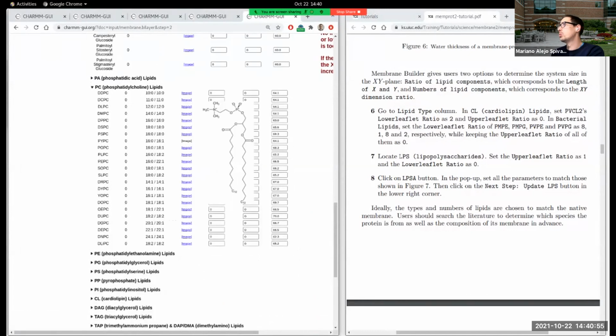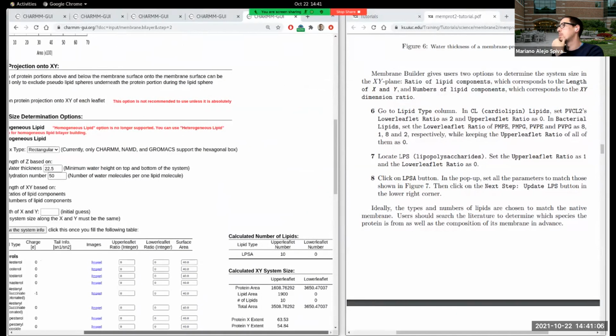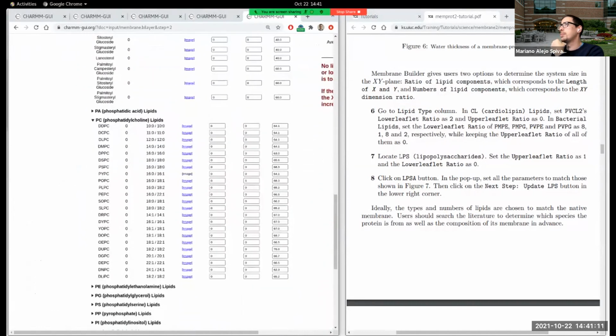So let's do POPC. Put a 1 here. Let's see if it works now. Okay.